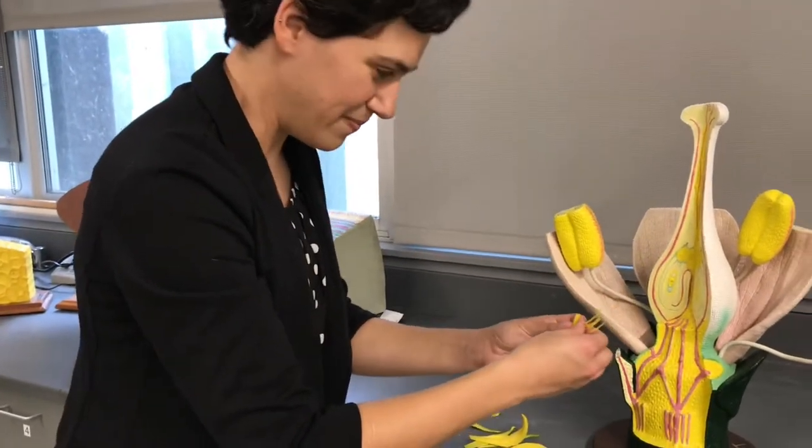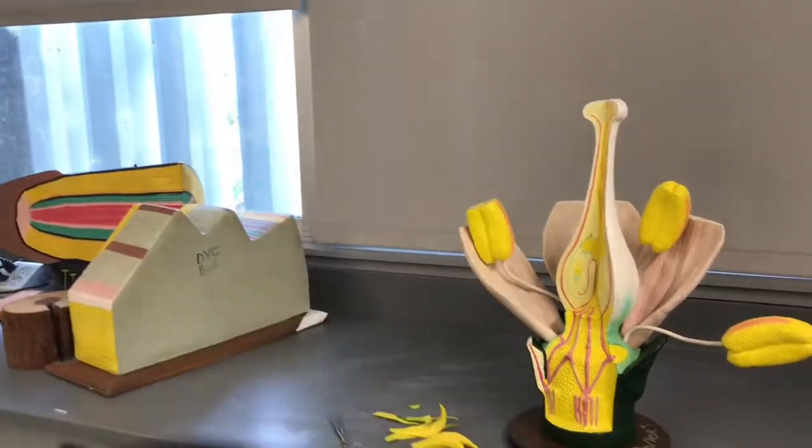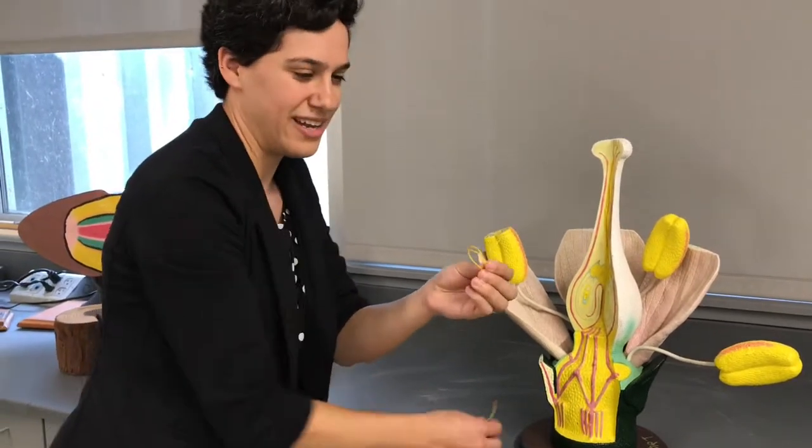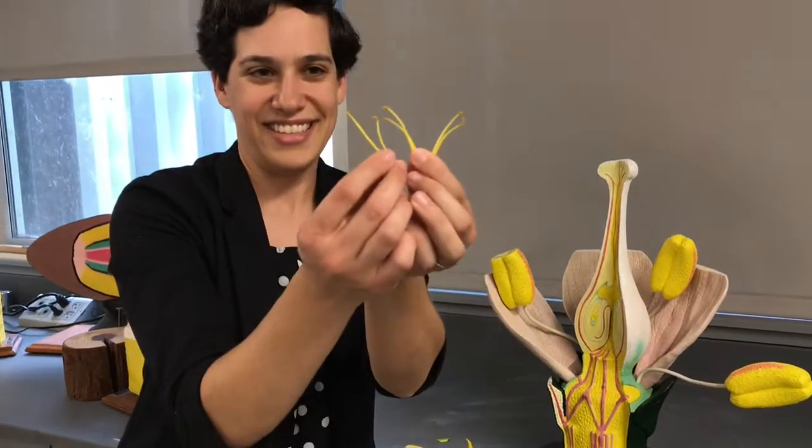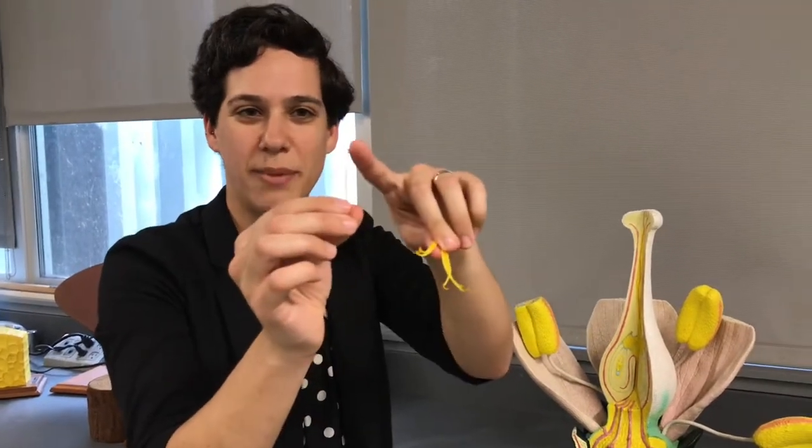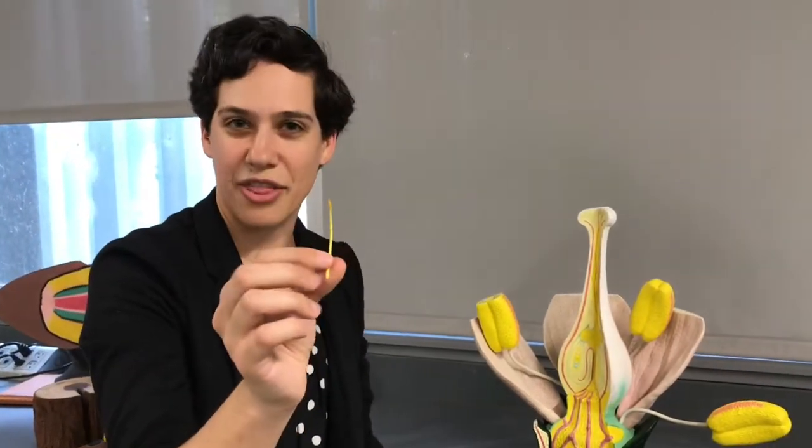Here are the stamens of this lily. I dropped one, but we've got many of them. So here we've got six stamens in this lily plant. And you can see there's a part up top that looks a little bit fuzzy. That's the anther.